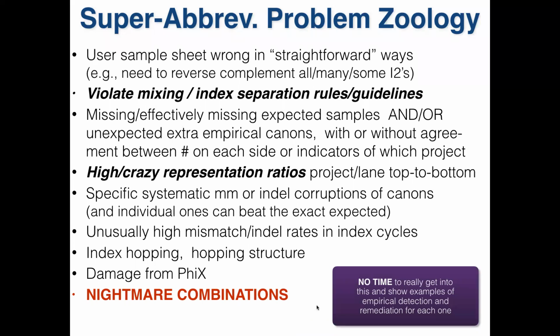I don't think the I1 has ever had this problem. The I2 has this problem. Some of the platforms do it one way, some of them do it the other. And the sample sheet will then generally have 3 columns. The I1 column, but then there are 2 I2 columns, and you pick the right one, the one that's later. If the sequencing is on NovaSeq, you need to know your platform to put the right sequence on because it does depend on it.